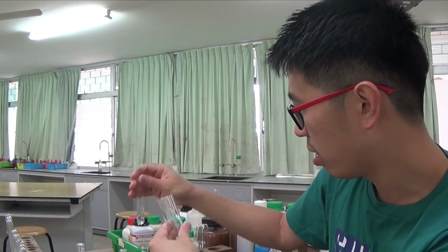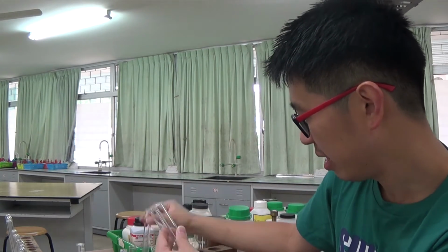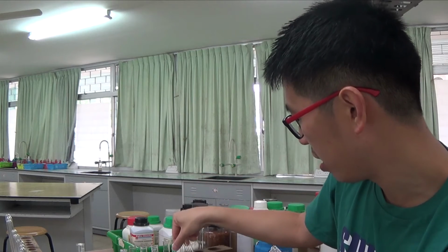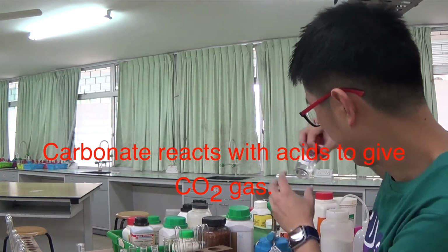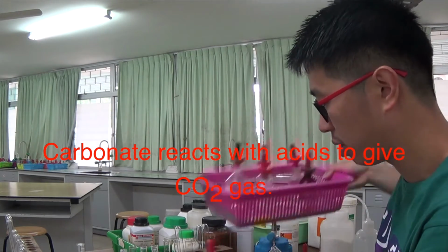We need to do quite a lot of tests here, because if you don't know what it is, you need to do quite a lot of tests. Of course we know what it is, so I just want to show you roughly what it means. If it contains carbonate, then when you add acid to it, acid such as, we'll bring this over here.